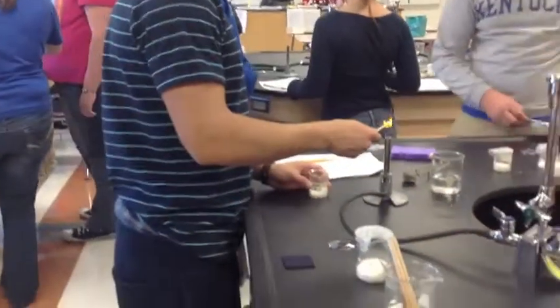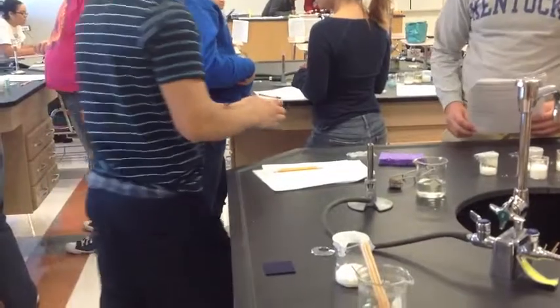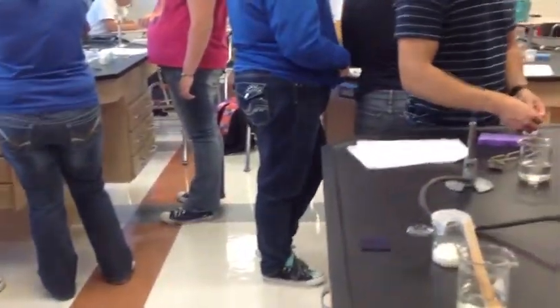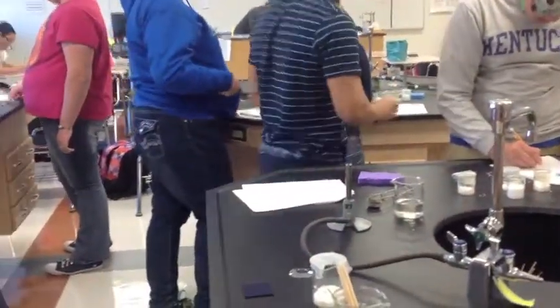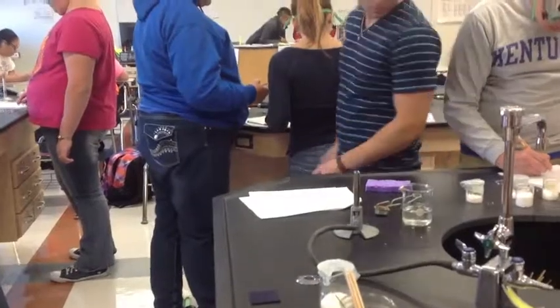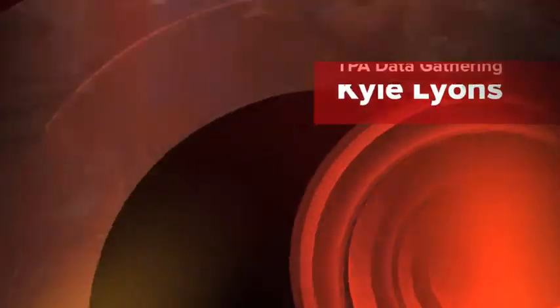So when you're done, make sure your Bunsen burner is off. Return your goggles to the goggle cabinet, and then begin working on your post-lab questions. I got green. We only have one unknown. Now we have unknown B.